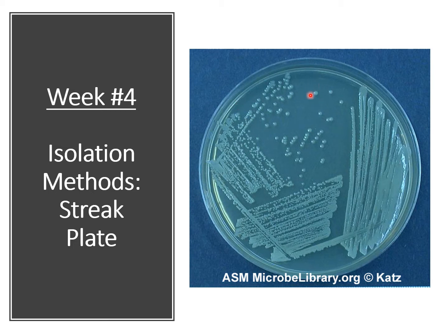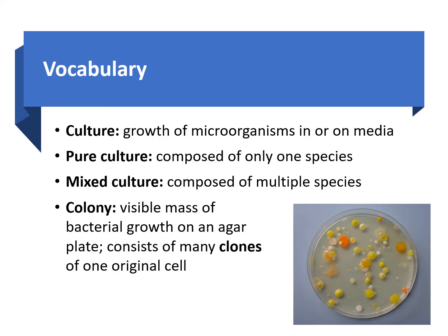And we get those single colonies right here. We're going to talk about how a streak plate can help us achieve a pure culture of that organism. We're going to discuss the details of how we usually culture bacteria and how we achieve that streak plate look right here. Let's first talk about a few vocab terms that you need to be familiar with.